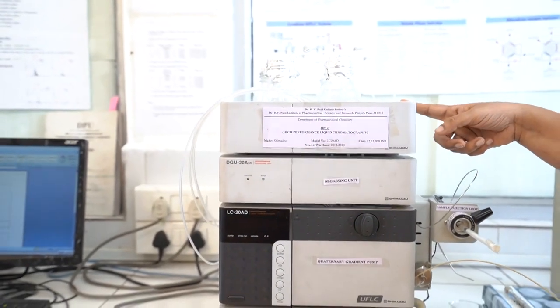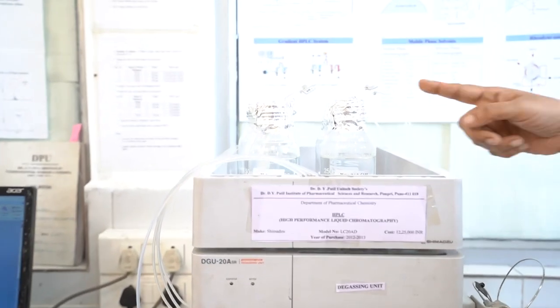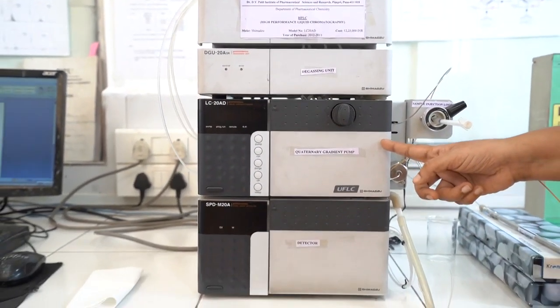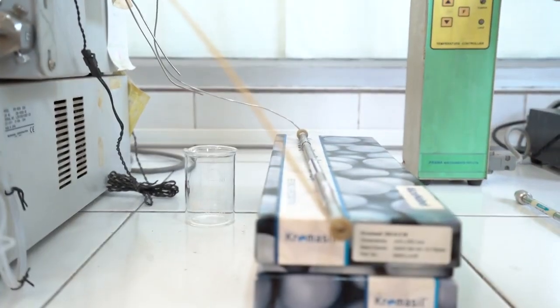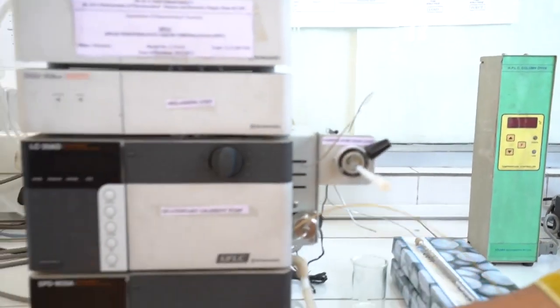The components of the HPLC system include the solvent handling unit, the degasser unit, the high pressure pump, the sample injector, the column oven, and the detector.